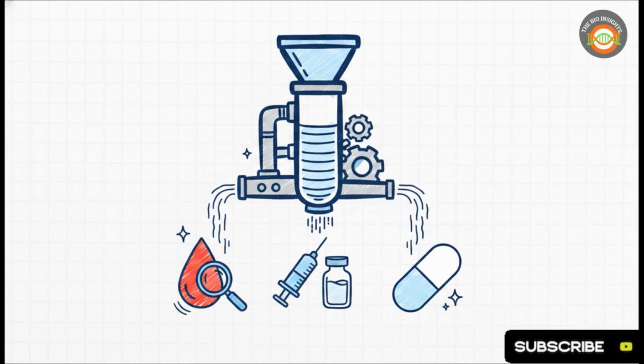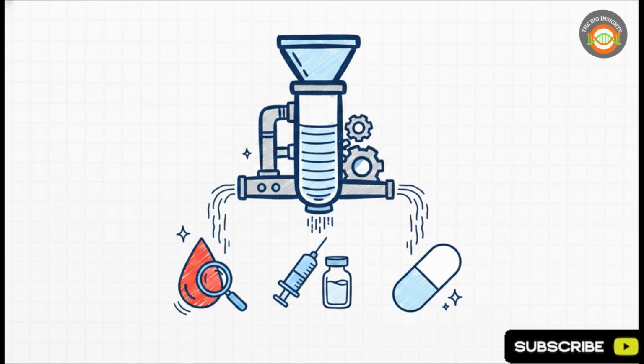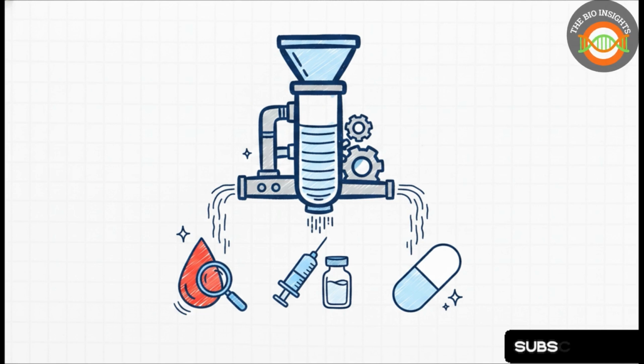We use these techniques to isolate biomarkers from blood for early disease detection. Pharma companies use massive columns to manufacture incredibly pure therapeutics and vaccines. Even size exclusion plays a huge everyday role. It's used constantly for desalting samples, quickly separating big therapeutic proteins from tiny, potentially harmful salt ions.